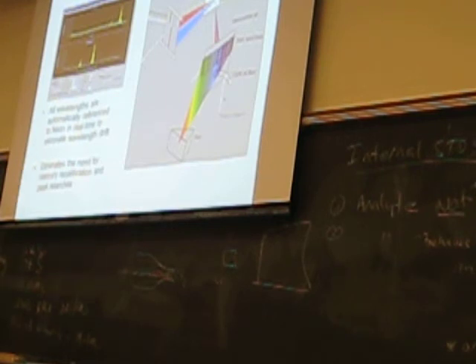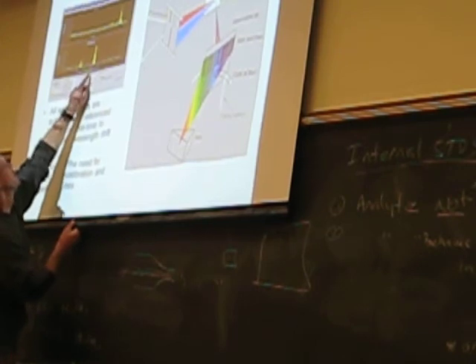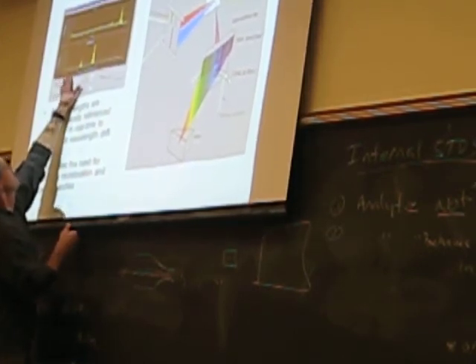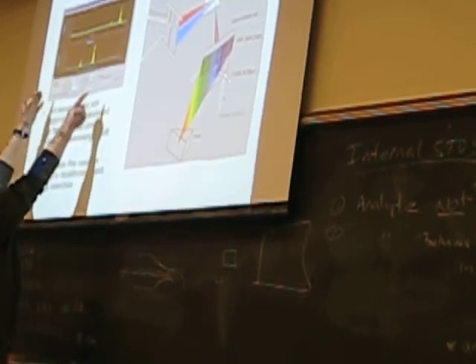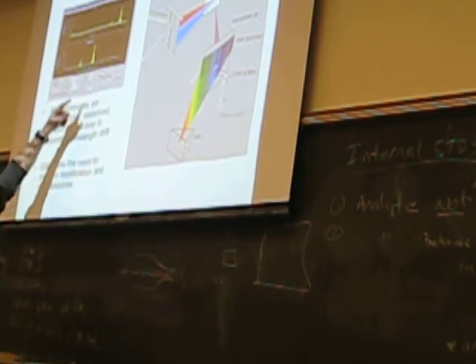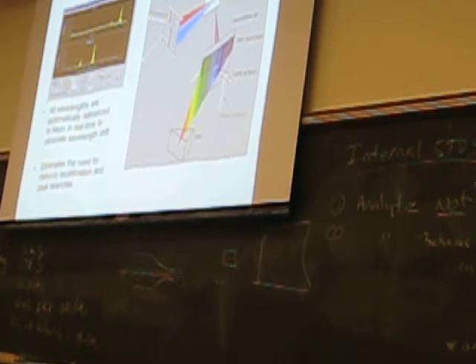And then while he's pumping that solution, he'll look at the photon intensity coming from your analytes, the emission, and they show up as intensity on particular pixels on the CCD array. So this is an array of pixels. In this case, it's 180 pixels, I think it says, or 170 pixels. That's the density of pixels within the area of the detector that the photons, 420.063 nanometers, will be hitting.